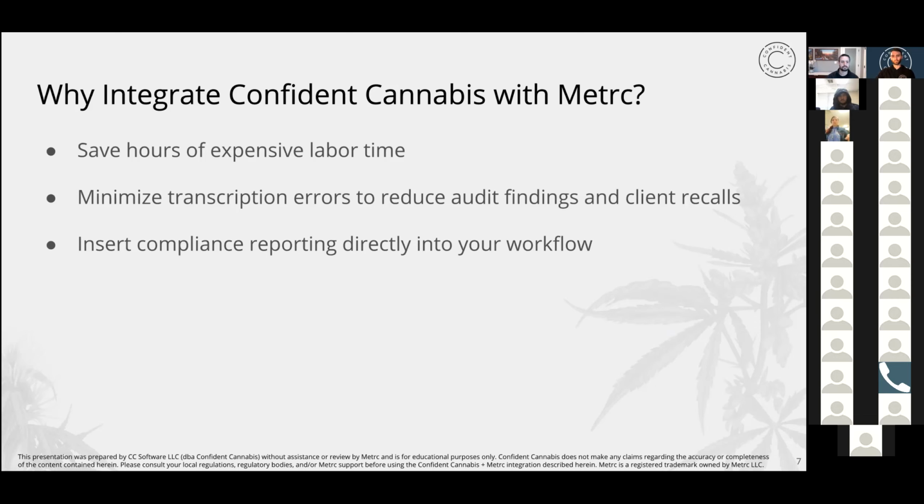It also inserts compliance reporting. So everything that you do in Metrc is compliance reporting. It inserts it directly into your workflow in Confident Cannabis. So you don't have to think about, okay, I'm doing this over here, and then I have to remember to go do this over in Metrc. It puts it right in the same workflow, so you never miss that step.